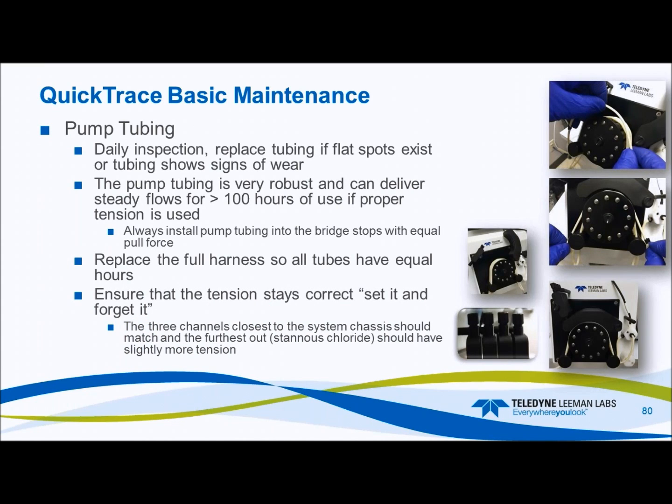Pump tubing, inspect it daily. It's pretty robust. It's going to last for 100 hours. Always install into the bridge stops with equal pull force. Replace the full harness. Don't just replace one tube you think is bad, because you're asking for problems. Ensure that the tension stays correct. Set it and forget it. Don't adjust it. Just let it go. Change the tubing harness if you spot problems with the pump tubing.